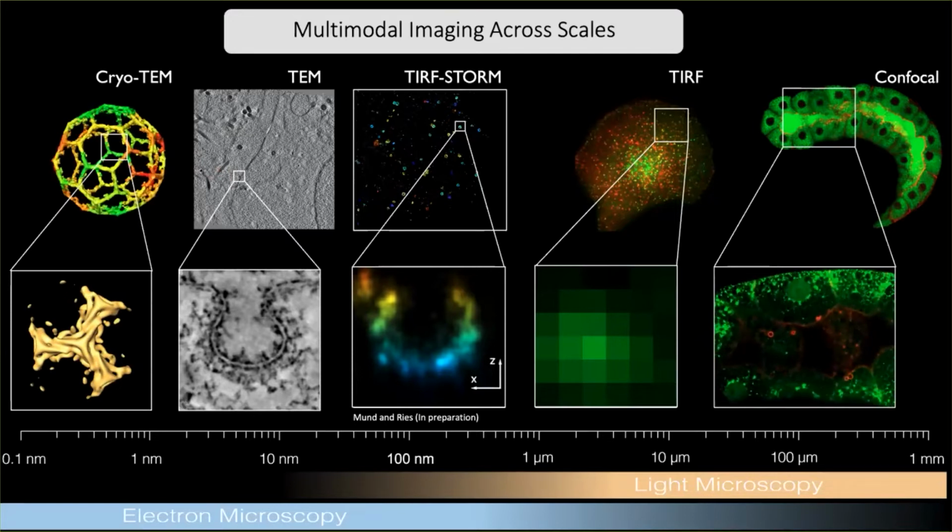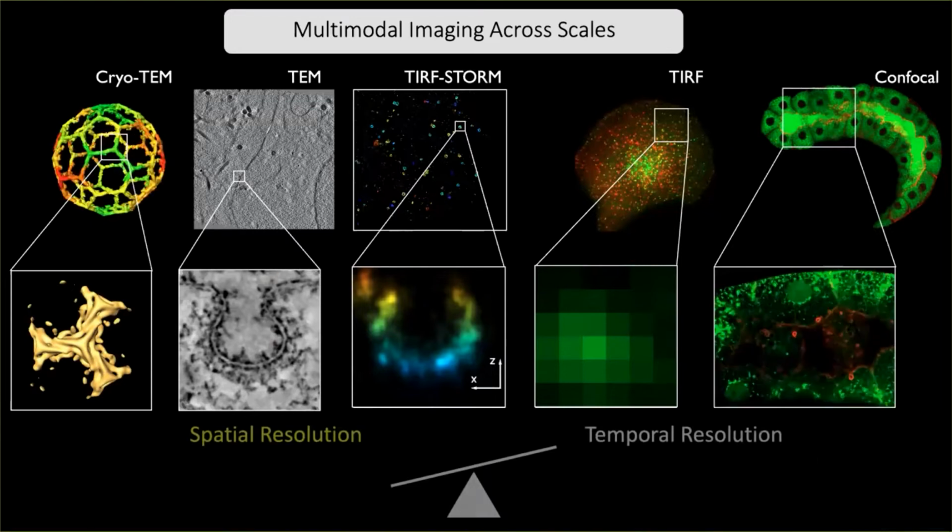Now, given that our goal maybe, and I hope you would agree, is at the end, if there is one, to understand all biology at the level of proteins and even lipids moving around, to understand their movement, their conformational changes, and how these changes result in biological function, I would say imaging is extremely appealing as an approach, but there are some challenges. We can use different modalities to get different levels of information. However, this results in a compromise: the more we require spatial resolution, the more we have to give up on the temporal resolution.